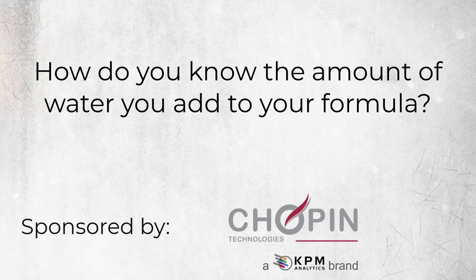If you mean during the process, well, you can correlate the Mixolab water absorption to what you do in your process. If it's about using the Mixolab, then you can work at adapted hydration, meaning that just like with the farinograph, you make a first test with a certain hydration, like, I don't know, 60% or 70% water absorption. Well, you can set up a target torque, a target consistency. That can be the one of your process.